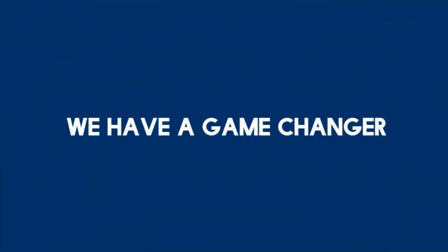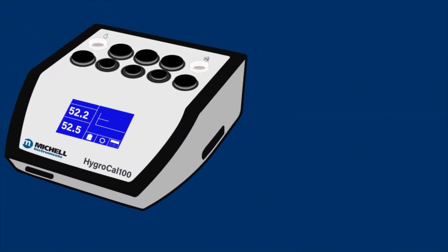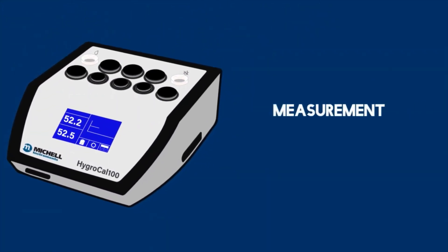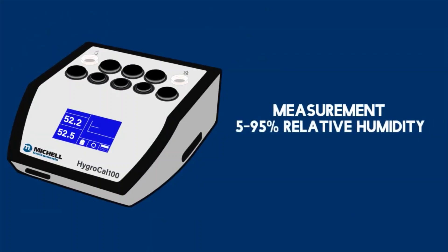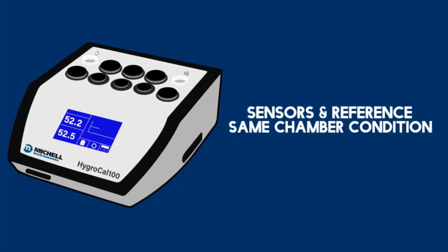But we have a game changer — the all-in-one validation package for your humidity sensors. The HygroCal100 provides accurate and drift-free measurement over a wide range of 5 to 95% relative humidity.